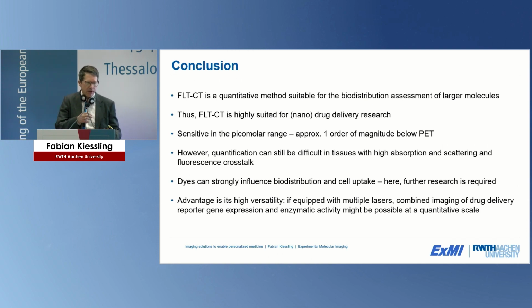And I think you can not only look at pharmacokinetics. If you would have multiple lasers in such a system, that would also allow you multiple analyses at the same time. You could, for example, use it on the one hand to look at drug delivery, and on the other hand to look at reporter gene expression by cells that were transfected previously, maybe even in combination with bioluminescence. And don't forget, it's also one of the most sensitive tools to assess enzyme function by using activatable probes. If you bring that all together, you have really a great, powerful tool in basic research.